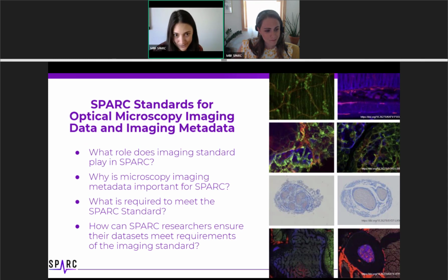We come with exciting news today. The SPARC standards for optical microscopy image data and imaging metadata were recently approved and endorsed by the SPARC Data Standards Committee. Hey, Macy, what role does an image standard play in SPARC?